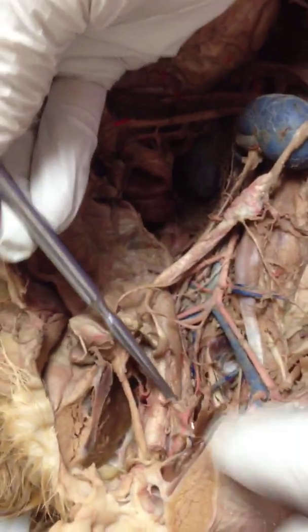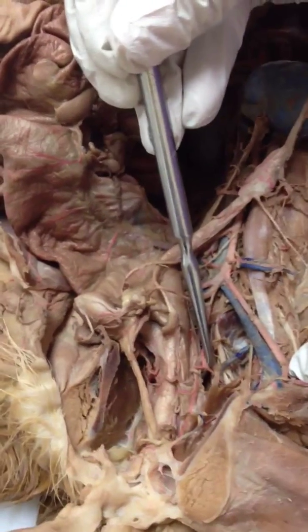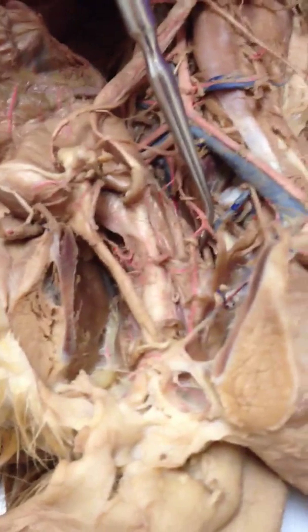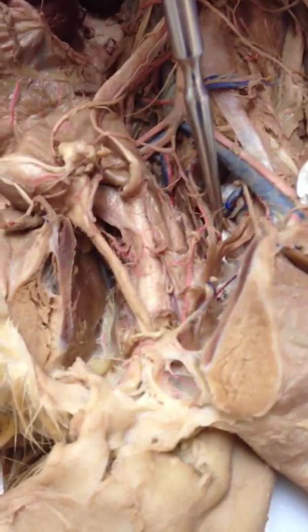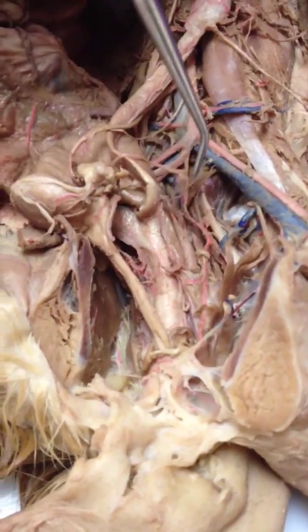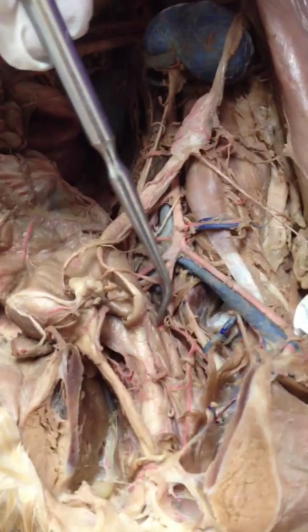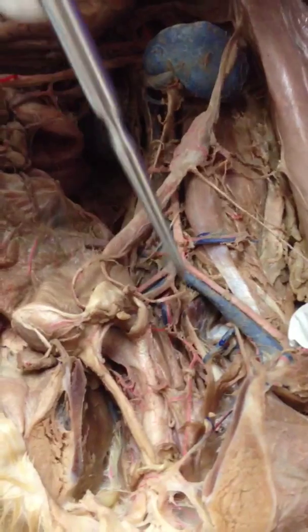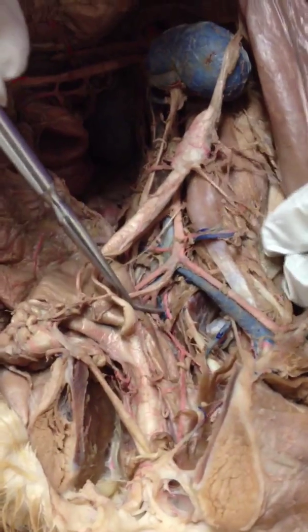We have the pudendal artery going to the shameful places. We have this other branch on the left-hand side being the left caudal gluteal. And then we have the cranial gluteal, which seems to have been broken. It would have been right here. And then we have the median sacral going to the tail, which would be back here, right here.